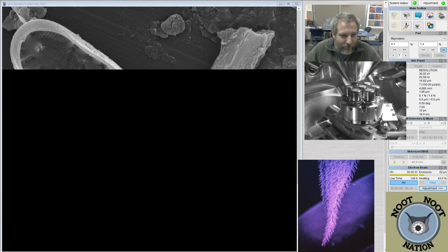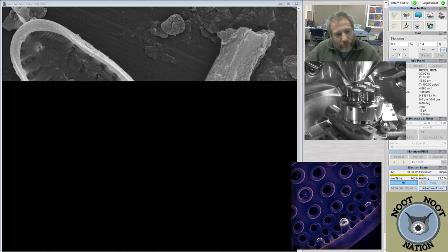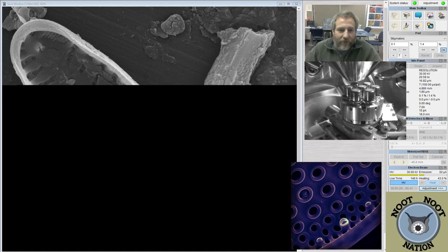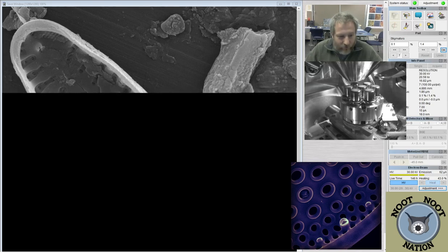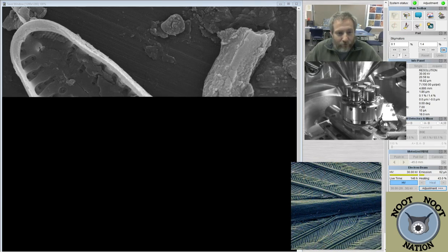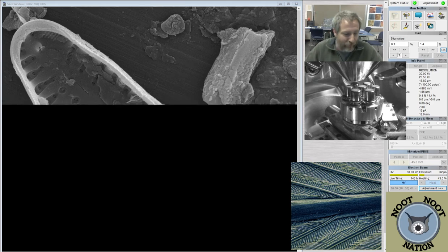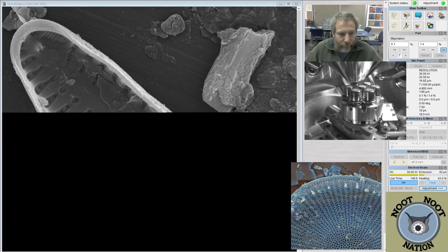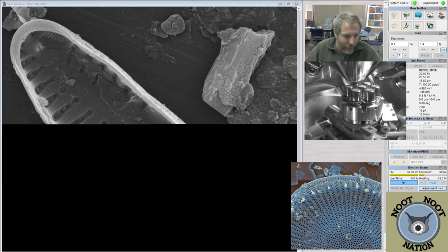Do diatoms stick to things, or do they float wherever the current takes them? A little bit of both. So some diatoms are floaters or plankton. Some diatoms like to stick to things. And it depends on what genus they are. So at some level, they're either one or the other. Usually you don't have both as an option, although there are some diatoms that kind of do both. Yeah, some travel around, some grow stalks, some live in colonies, some stick to things.